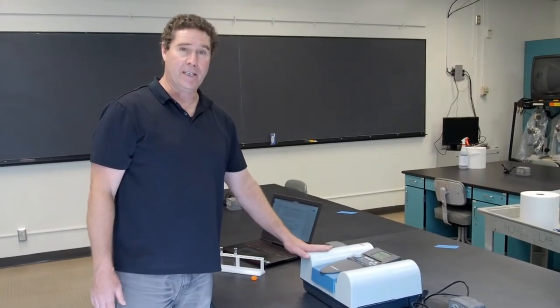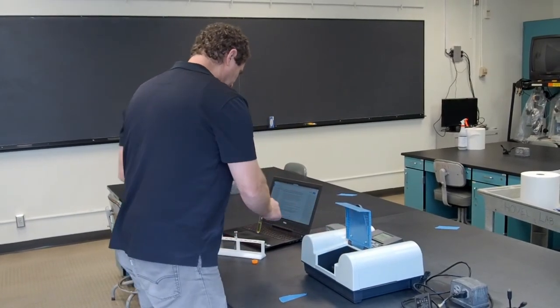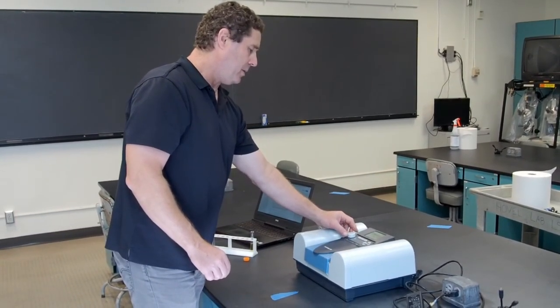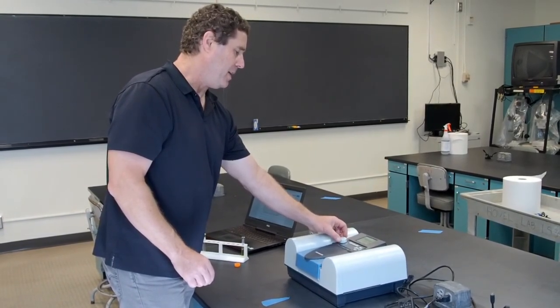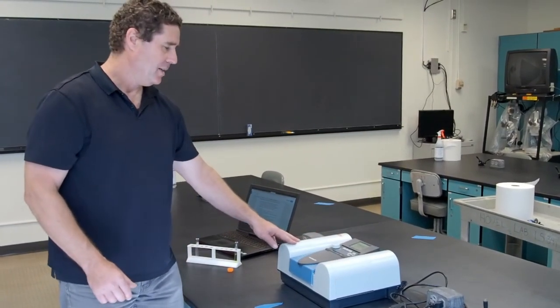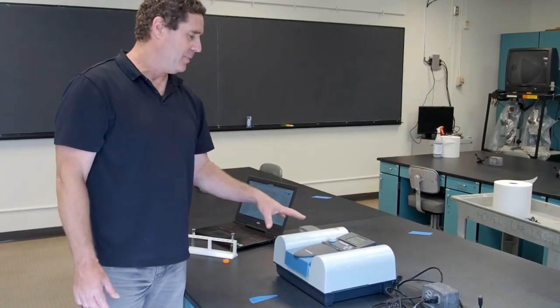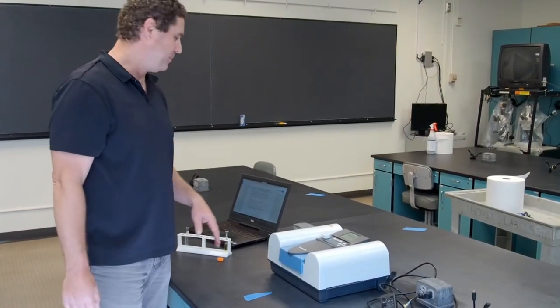Okay, so we have our first reading at 480 nanometers. We're going to pull this sample out, and put in our acetone blank once again. We're going to turn our wavelength up to 510 nanometers, which is our next reading. Okay, 510 nanometers. I'm going to re-zero. So I'm going to press the 0 button once again and get the machine to recognize acetone at this wavelength as 0 absorption.